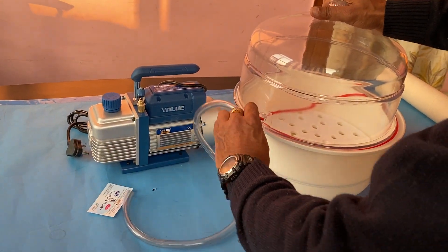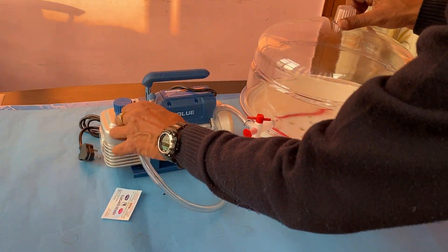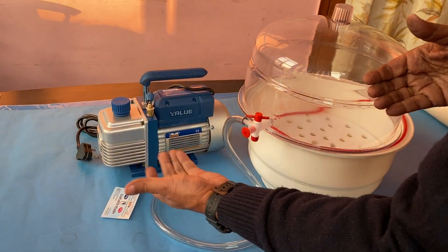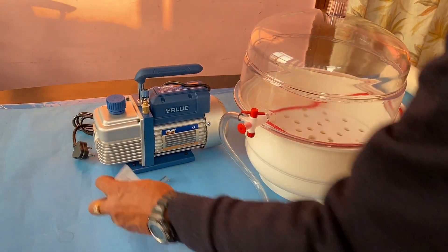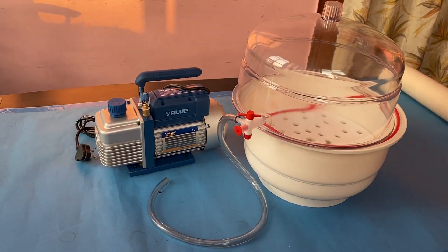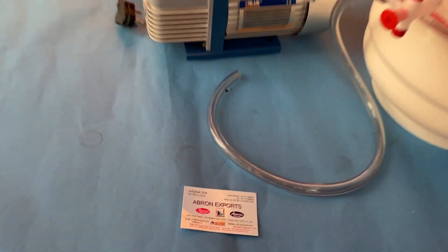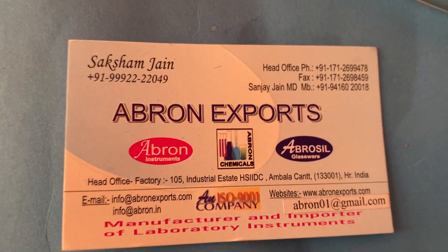This is the vacuum stopcock. You can attach it, and you can use a longer one also — we are just showing as a sample. This can be attached and used in the lab for doing the vacuum.